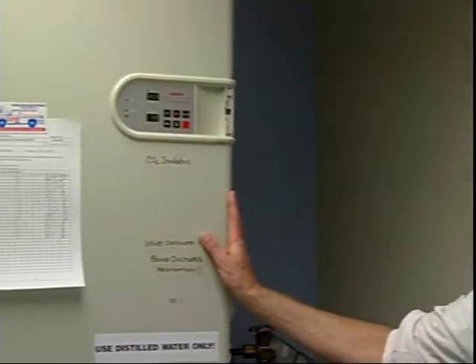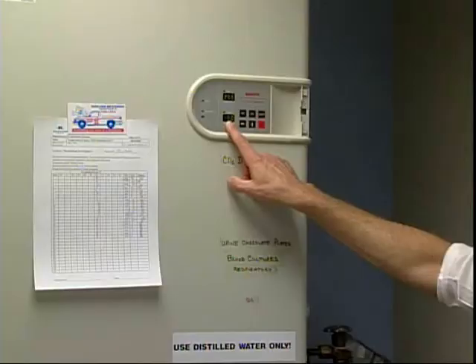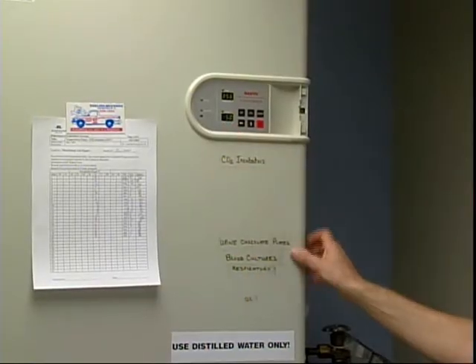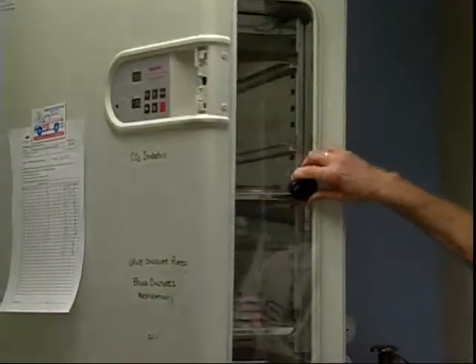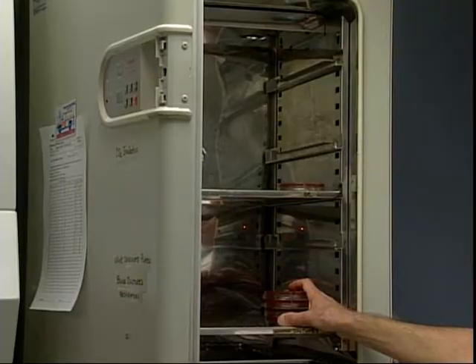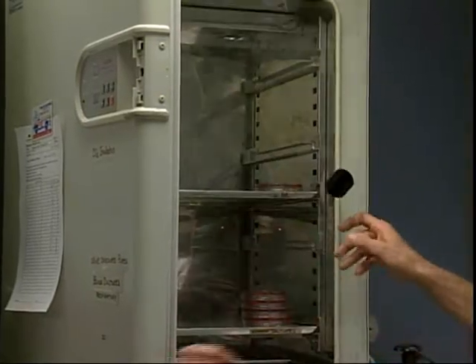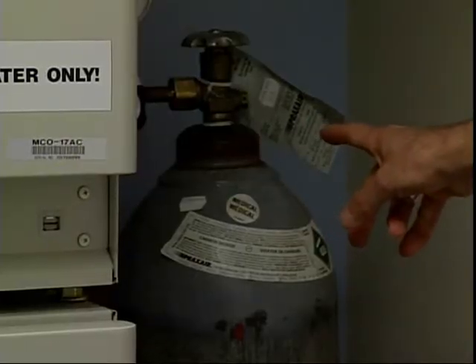And a CO2 incubator is an incubator that has approximately 5% of carbon dioxide injected into it. And that is required specifically for organisms like Haemophilus and Neisseria. They won't grow without that CO2. So we have a CO2 tank that is stored beside the incubator, and that's pumped in continuously.